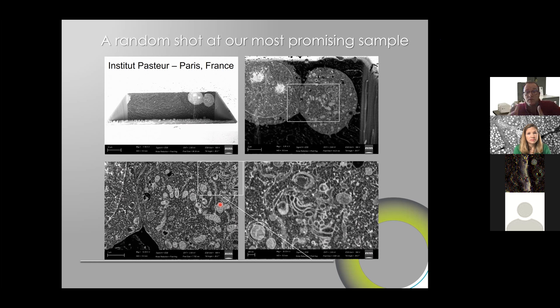And I said, look, for the moment, I don't have enough resin because there were only batches of 10 mLs each time I was working with it. So I had to be careful with the amount I had. But I have this block. I don't know. It's good in TEM. Do you want to give it a look? So I gave it to him.